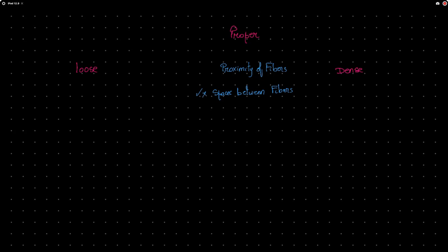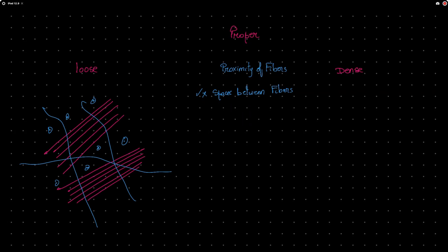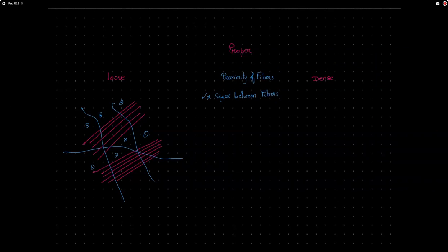So if I'm looking at a type of connective tissue that has collagen fibers and elastic fibers in it, and it has lots of spaces that contain scattered cells, like fibroblasts, I'm looking here at the areolar connective tissue. And remember, the areolar connective tissue is widely distributed in your body underneath the epithelium to allow the movement of the fluids and nutrients up towards your avascular epithelium.